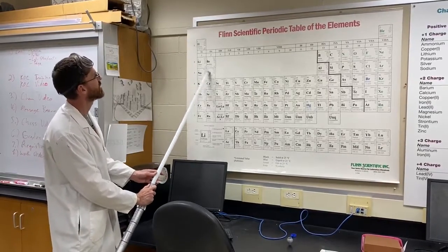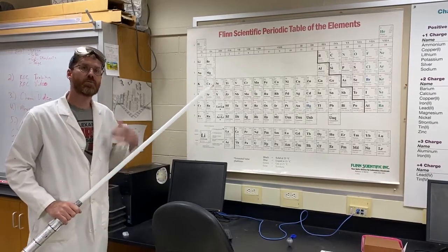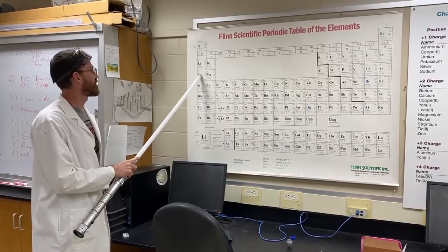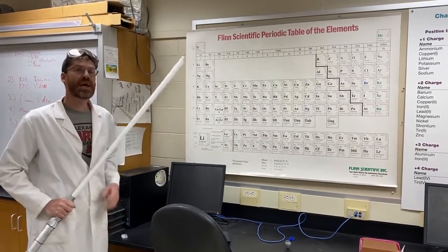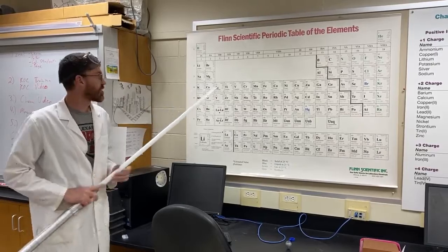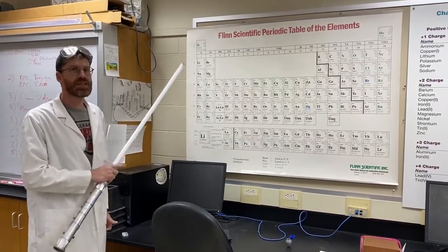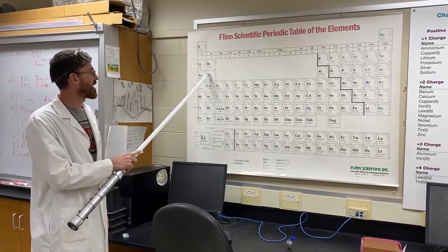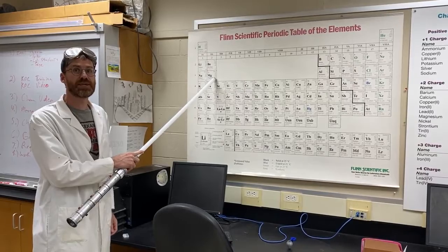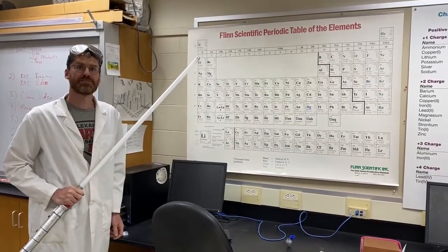And you're going to find as we go this way to the left, you're also going to have more reactivity. So sodium will be more reactive than magnesium, and potassium will be more reactive than calcium. So to recap, go down, more reactive, and as you go left, more reactive. So we predict from that the least reactive will be magnesium, and the most reactive will be potassium. So let's take a look.